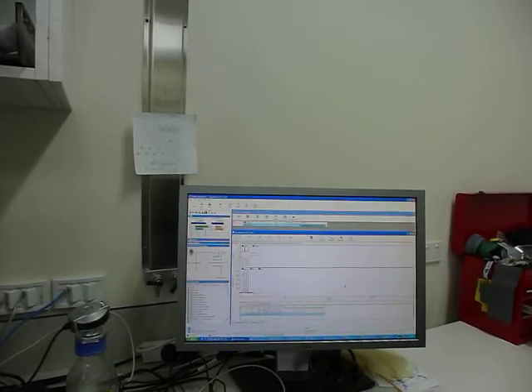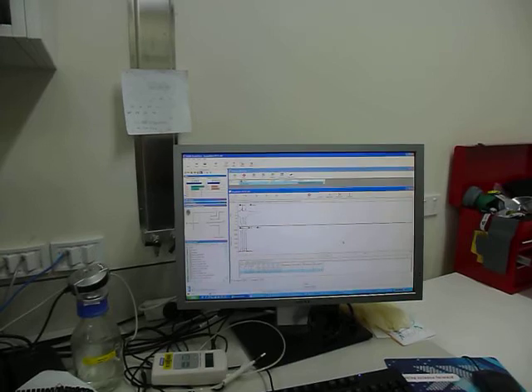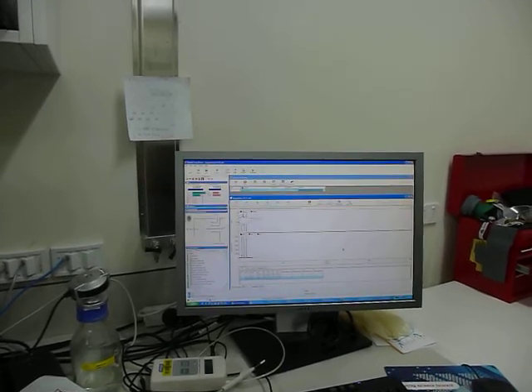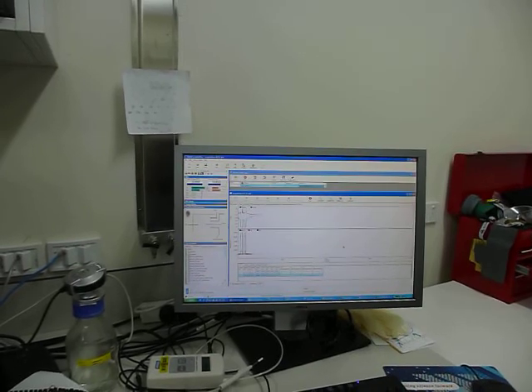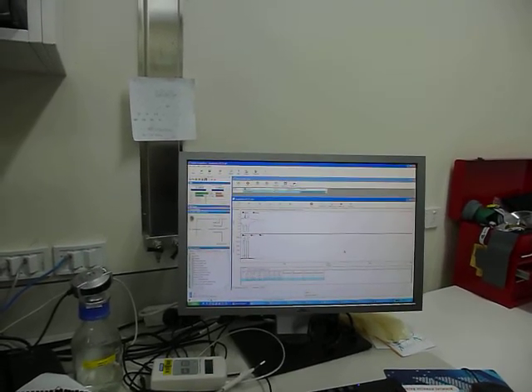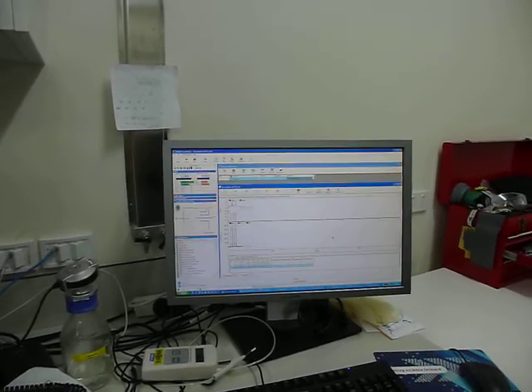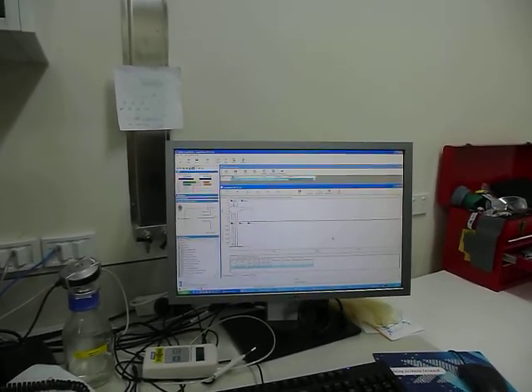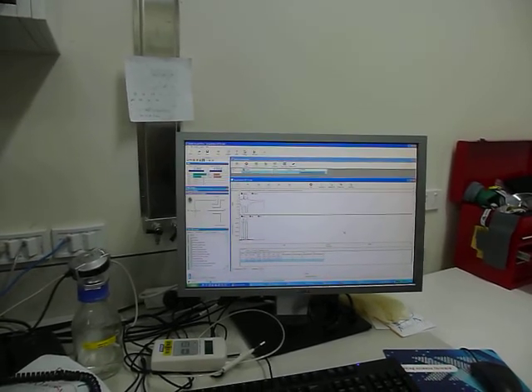As I explained in other videos of this series, everything is controlled by the script. So AutoIT controls all the software together, so they work one after the other in synchrony, and then we can couple the equipment. So yes, the peaks are coming. See?